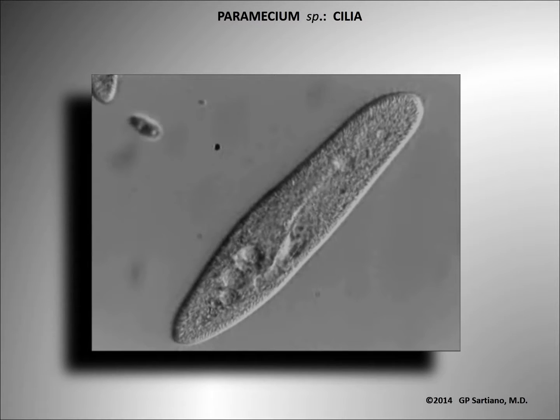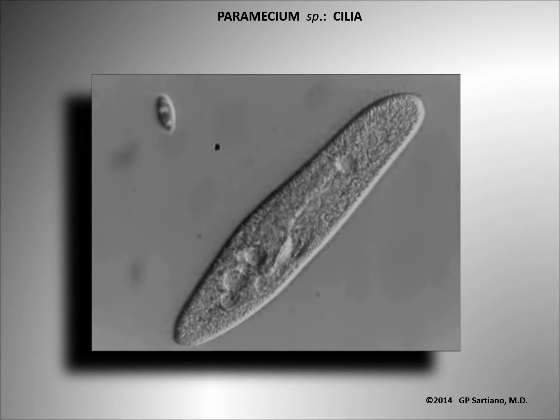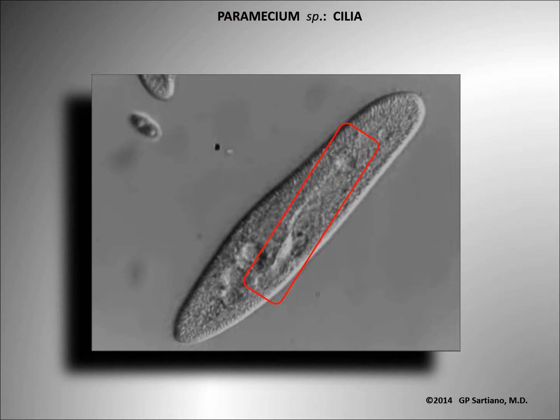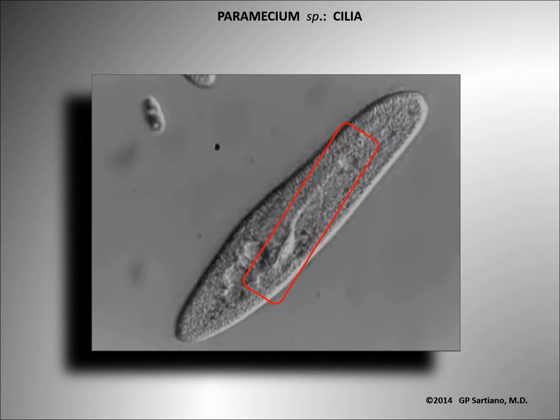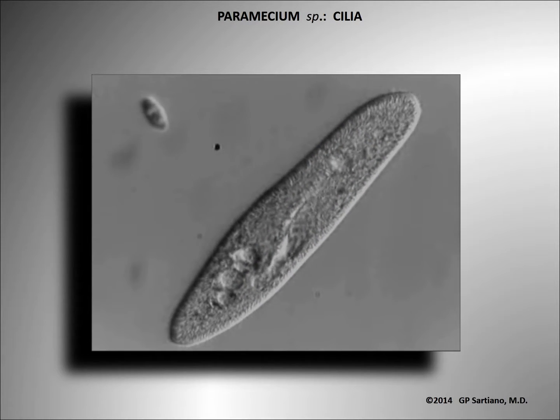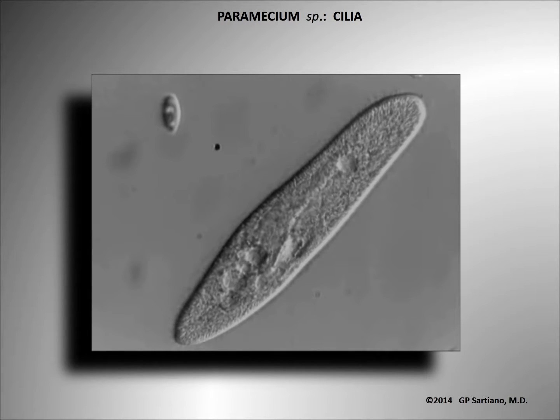This video provides a hint that there are additional cilia, in this case an organized, coordinated group in the oral groove and the food ingestion pathway.